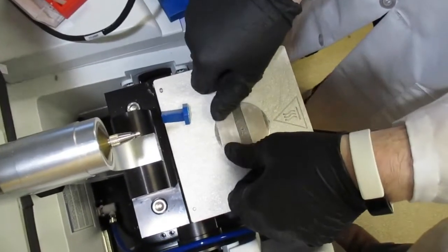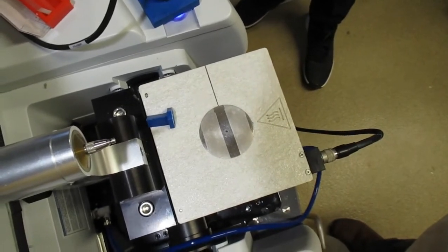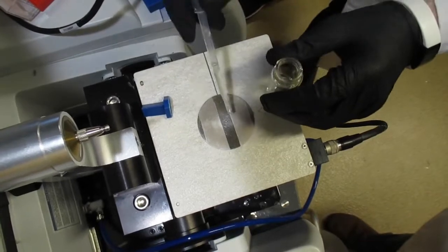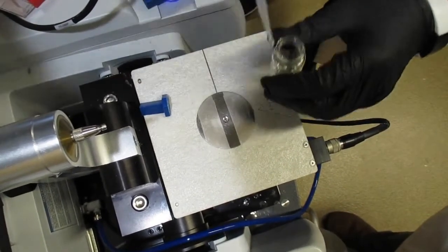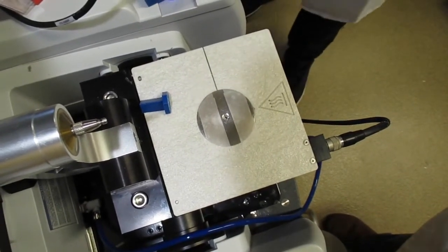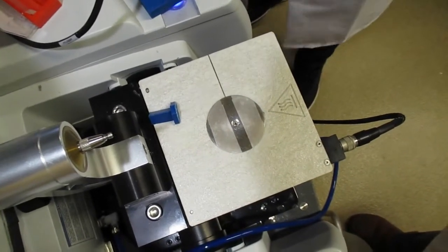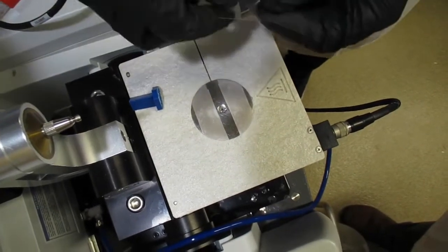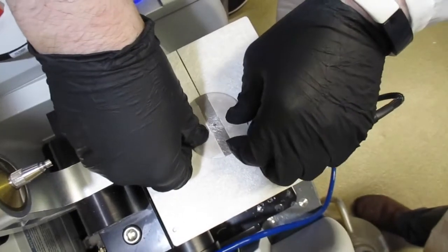Okay. Once you have placed your tape, you can take some of your sample, and you only need like 1 or 2 drops at most. And then what you can do is you can take the glass cover and you can place it on top of the sample, like so.